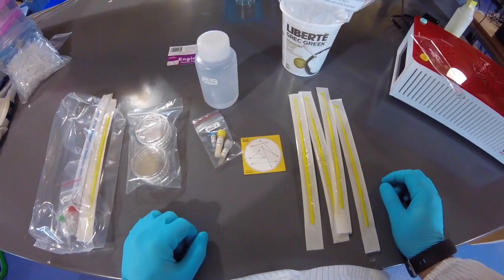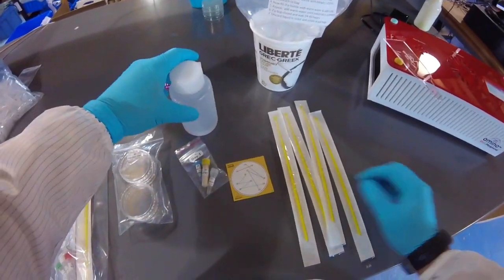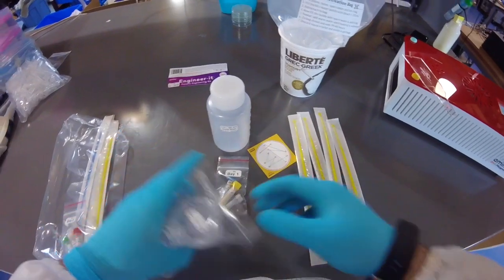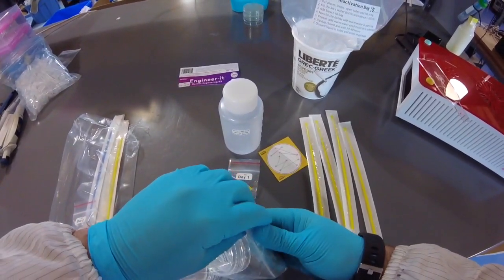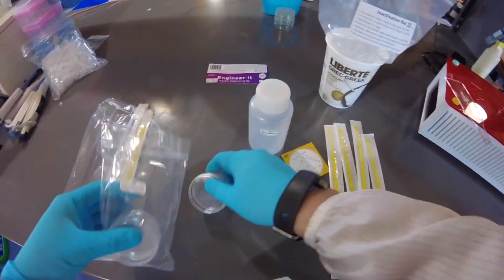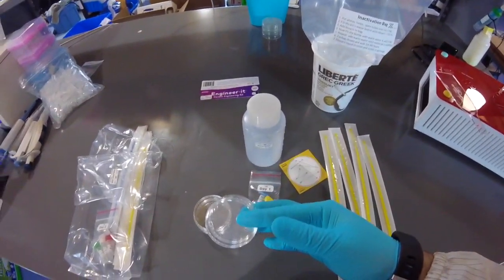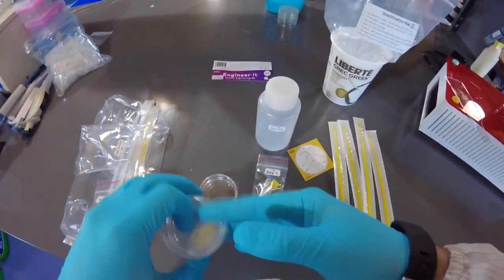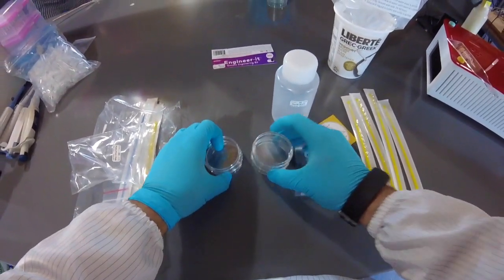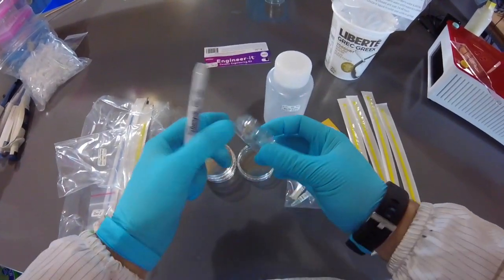Okay, so the first step is to make the plates, and for that we're going to need the Petri dishes. We're going to label them with a Sharpie. All right, and when you label plates, you always want to label them on the bottom, okay?